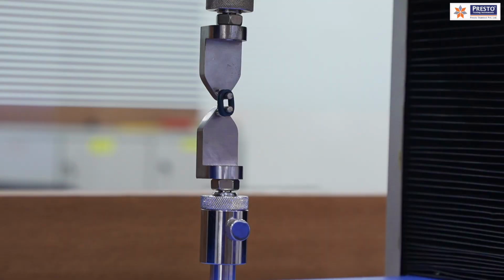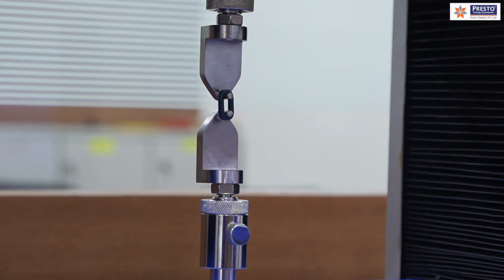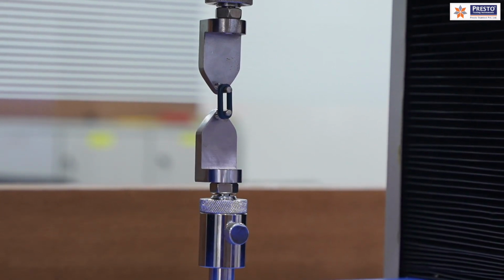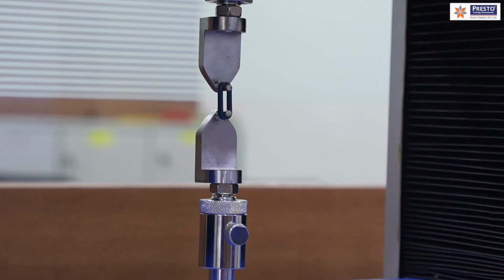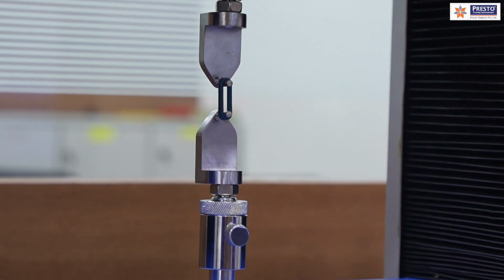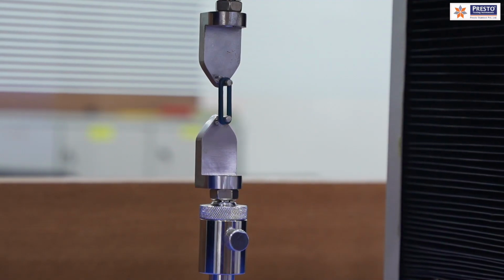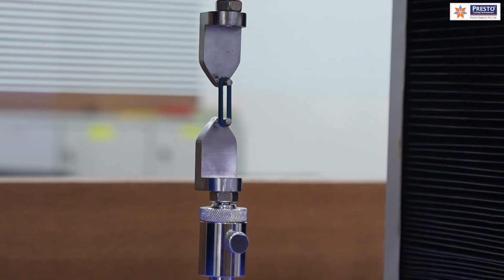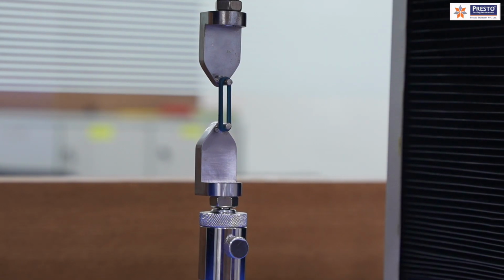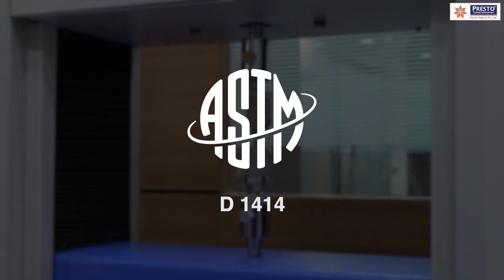A universal testing machine can help in detecting the mechanical strength properties of an O-ring. Industries now check O-rings from suppliers who have a proper audit and testing, and proof of their specific results for these O-rings. If the standards are not met, then they don't take from there. So it is for the compliance of ASTM D1414.